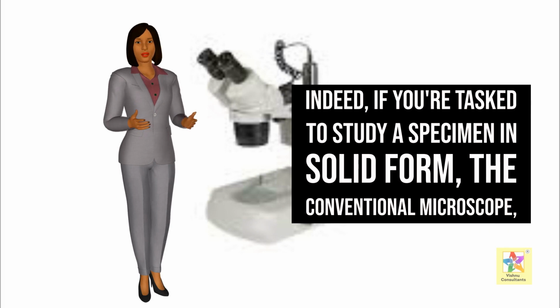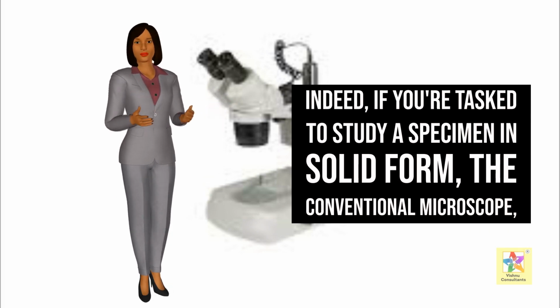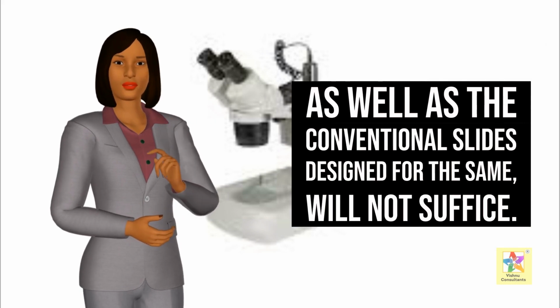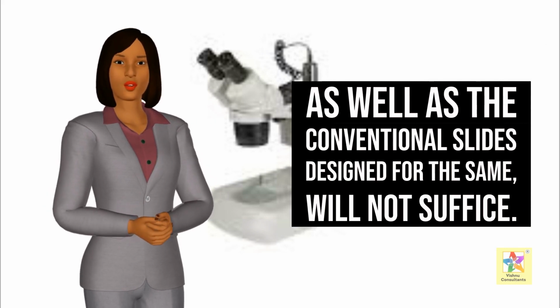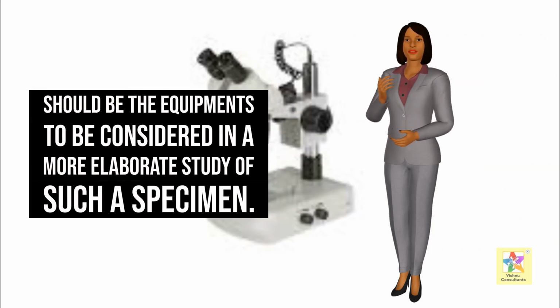Indeed, if you're tasked to study a specimen in solid form, the conventional microscope, as well as the conventional slides designed for the same, will not suffice. Stereoscopic microscopes, those that many have labeled as binoculars in reverse form, should be the equipment to be considered in a more elaborate study of such a specimen.